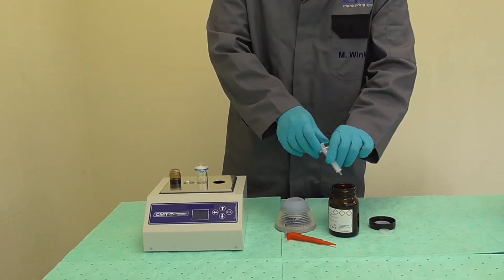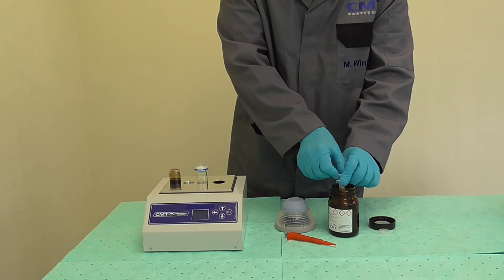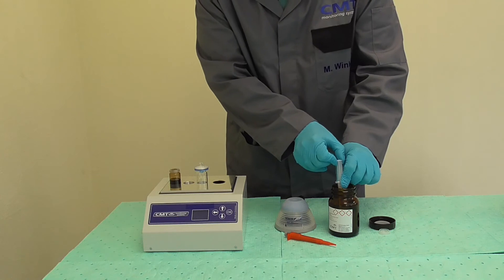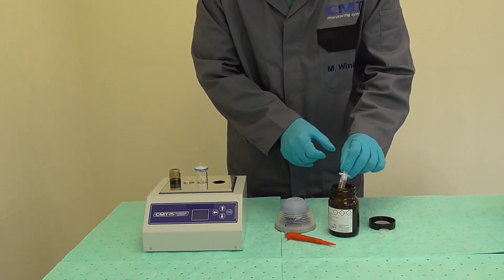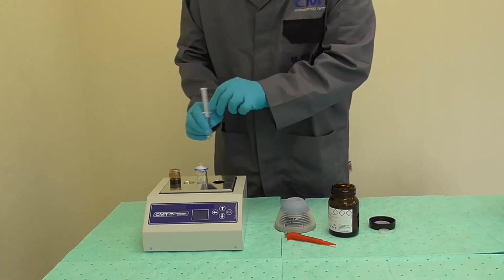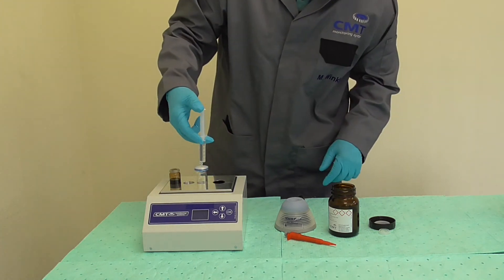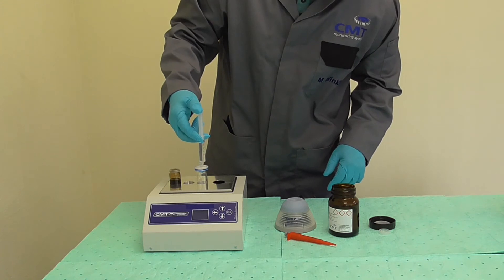Fill a six milliliter syringe to its six milliliter mark with cat fine reagent. Mount the syringe onto the filter and push one milliliter through the filter into vial number two. Leave the syringe on the filter.